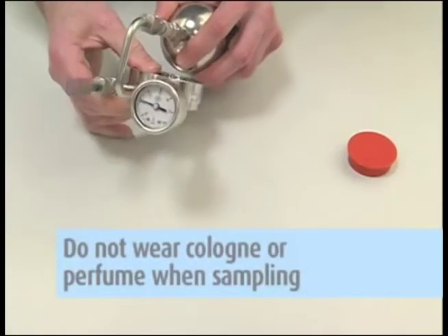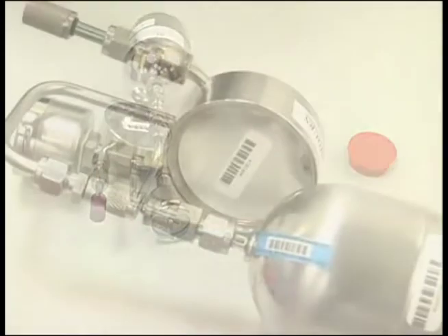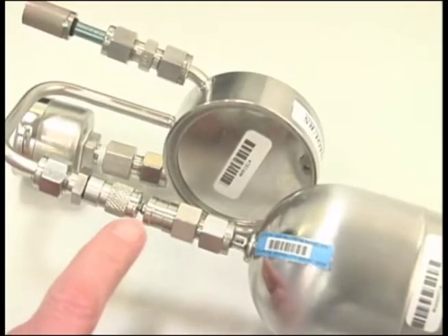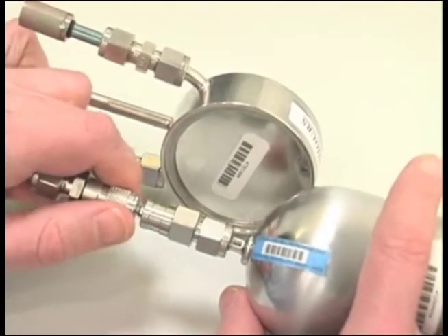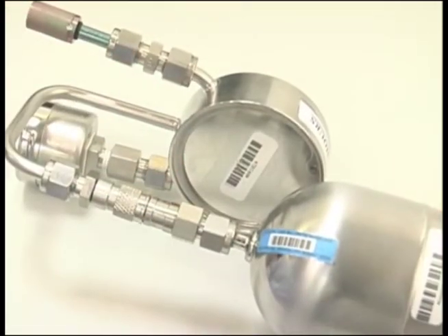Tips: Do not wear cologne or perfume when you perform the sampling. It could interfere with the sample results. Make sure there is no gap between the regulator and the can. If there is, the regulator is not seated and you will need to remove and reposition the regulator.